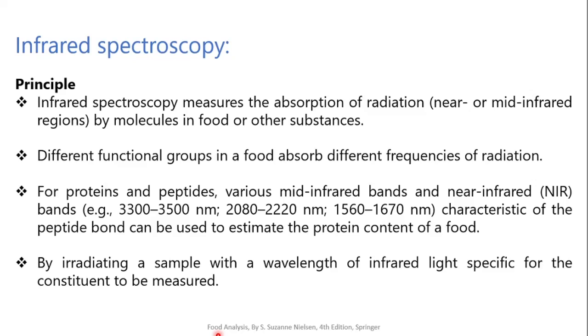By irradiating the sample with a wavelength of infrared light specific for the constituent to be measured, it is possible to predict the concentration of that constituent by measuring the energy that is reflected or transmitted by the sample. So that energy is inversely proportional to the energy absorbed.